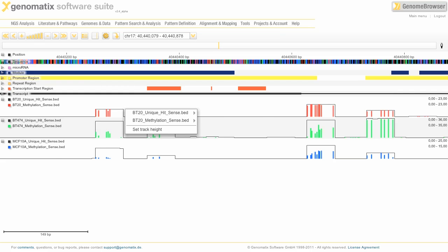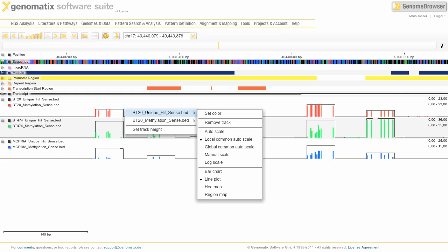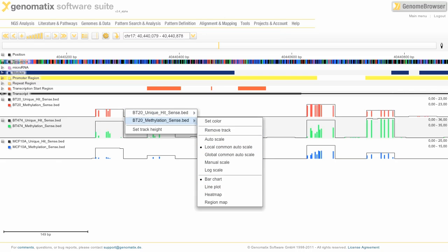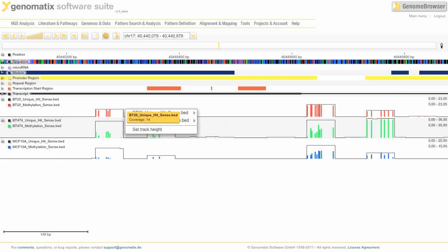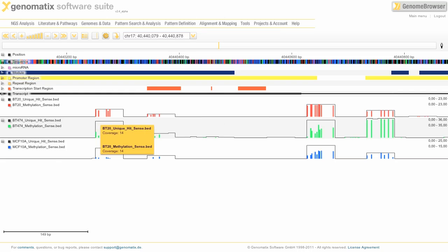The first file, the unique file, is plotted in local common autoscale and it's plotted as a line. Whereas the methylation file is also plotted as local common autoscale, but plotted as a bar. So the black line you're seeing here gives you the overall coverage.